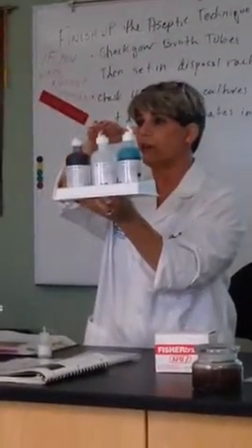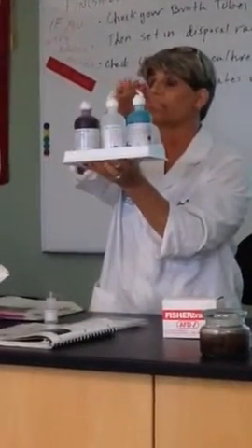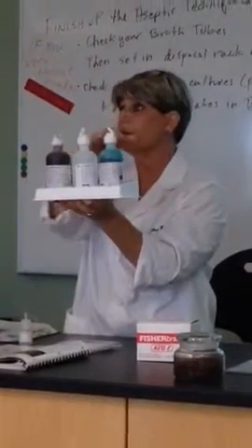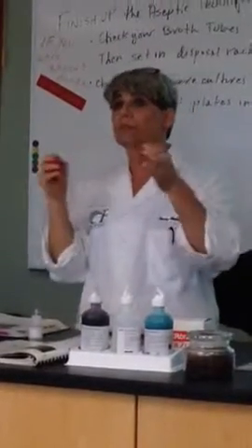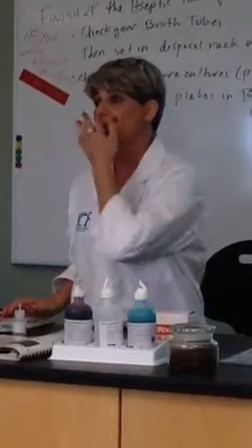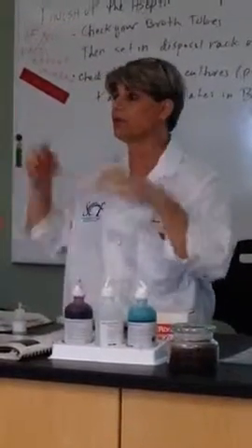That's why I have it set up like this, so you can see first the pink carbol fuchsin, then you decolorize, that's the determinative important step, then you counter stain with brilliant green to give contrast back to the cells that were clear when you decolorized. Around the room, I set up little baskets that have these same three things, only they're in smaller bottles because the smaller bottles are easier to work with. These come dumping out so fast, they're hard to work with, so I put them in little bottles for you. Okie dokie. So, that's what you're going to do.